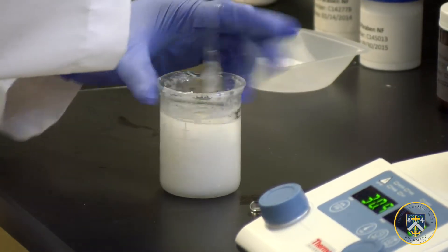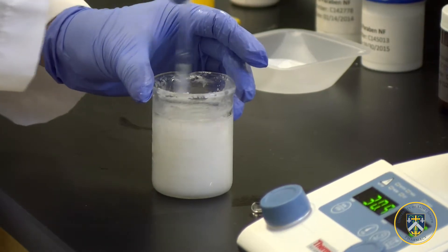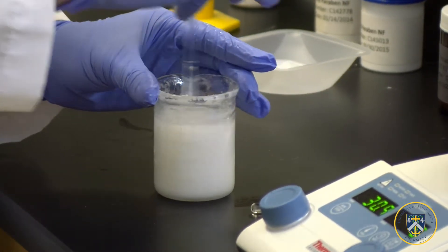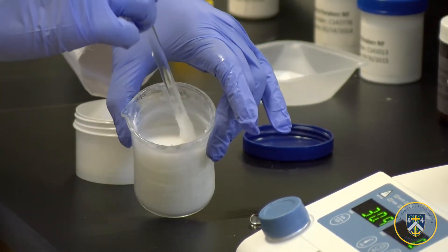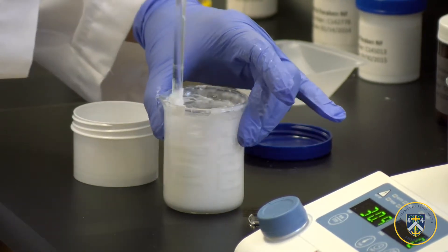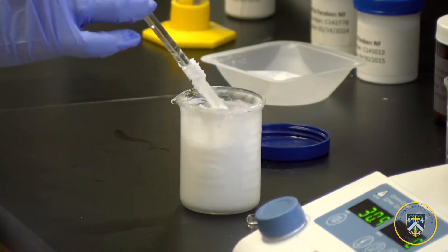Simultaneously the ointment will start to cool and form a consistency equivalent to heavy cream. Now that we've reached a very cloudy, thick solution equivalent to heavy cream, we can transfer the hydrophilic ointment to our jar.